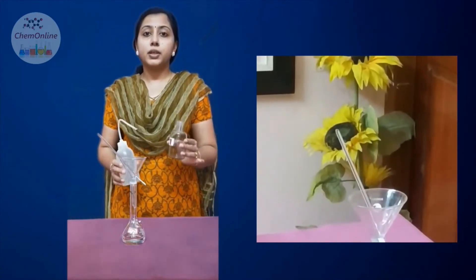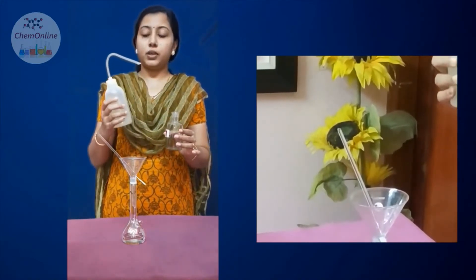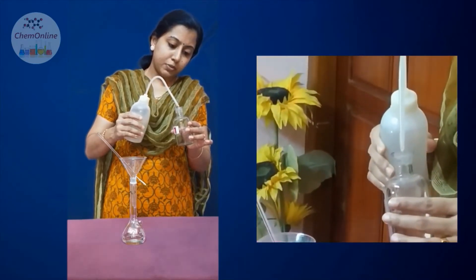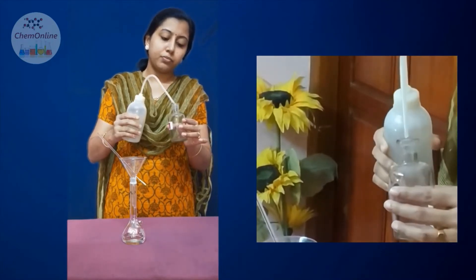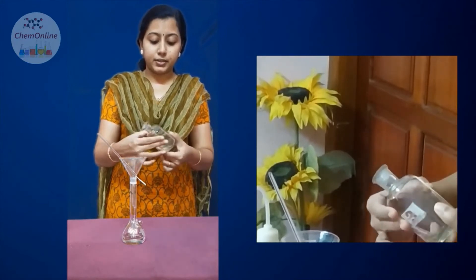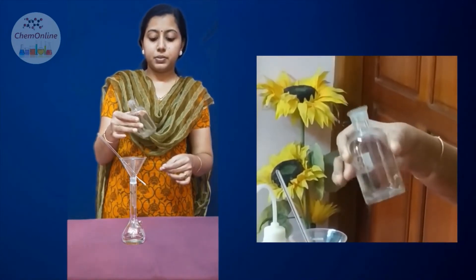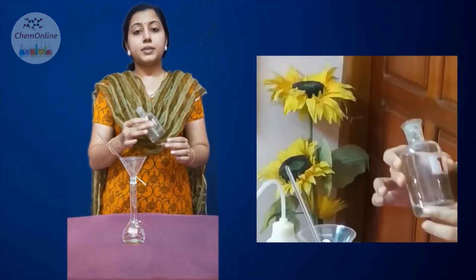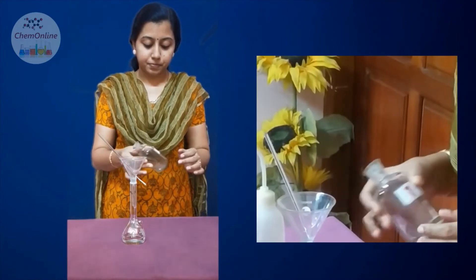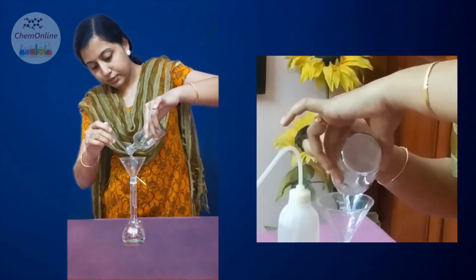The next step is to wash the solution bottle so that all of the solution has been transferred into the standard flask. Using a wash bottle filled with distilled water, pour a very small quantity of water along the sides of the solution bottle. Then swirl the solution bottle so that any solution sticking to the walls will mix up. After swirling, again transfer the solution through the glass rod.